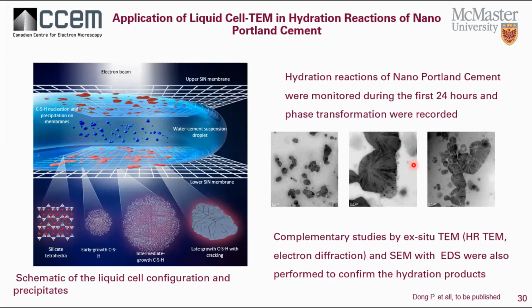So understanding the cement hydration reaction, especially in early ages, which can contribute to early microstructure and strength development, is critical for both scientific and environmental values. In this study, we monitored the hydration reaction of nano portland cement during the first 24 hours, and we recorded all the phase transformations.